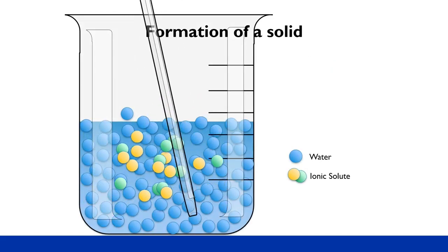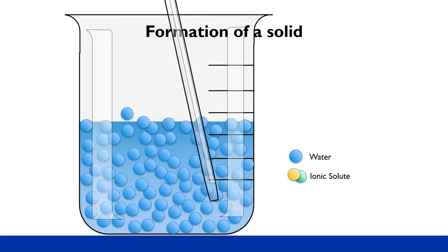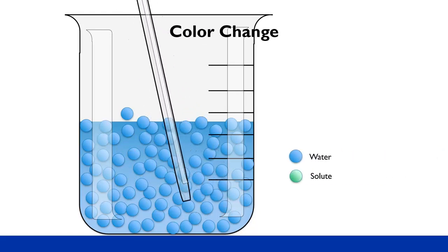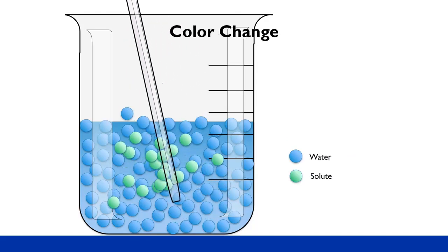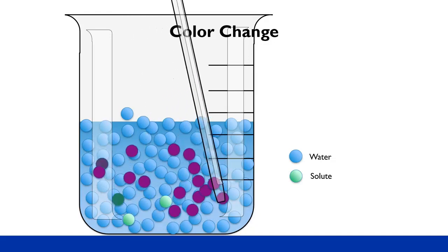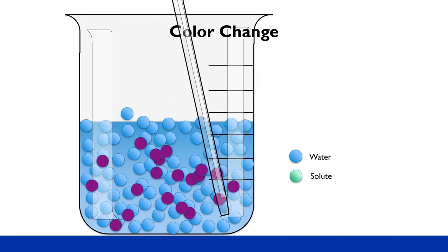Yes, solubility will be one of the things we're observing. You need to keep an eye out for the formation of a solid, also called a precipitate, in your wells. Color changes are just like they sound. You'll see the color of your solution change as it's mixed with another substance in the solution.